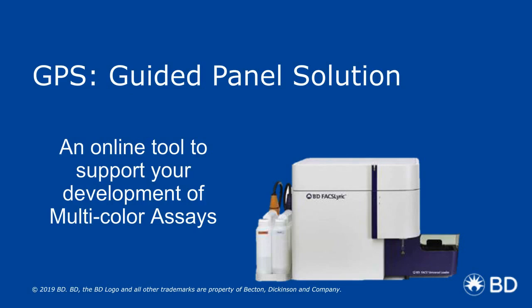This is an online tool to support your development of multicolor assays. Now, I want to be very clear at the beginning. This tool does not tell you which reagents to use. What we're doing is giving you some guidance more as to which reagents not to use together.